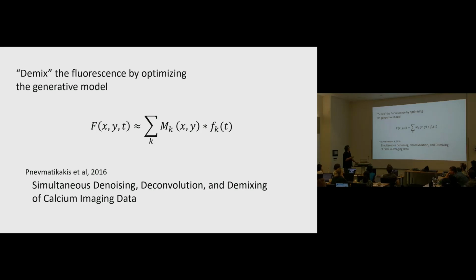We're going to think a little bit about demixing in the context of these. When we actually get down to try to analyze this kind of very dense data, we have to really start thinking about overlaps. Like with cortical recordings, we kind of avoided as much as possible to think about overlaps between cells. Actually, what we do by default is we throw out any area of overlaps. We don't bother to demix it because that's hard and a little bit black boxy. We just throw out those areas.